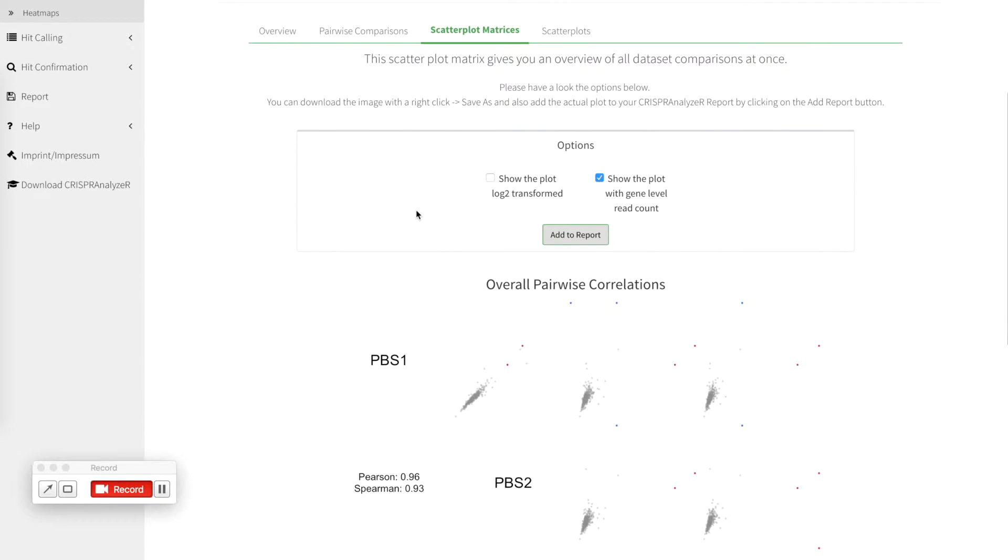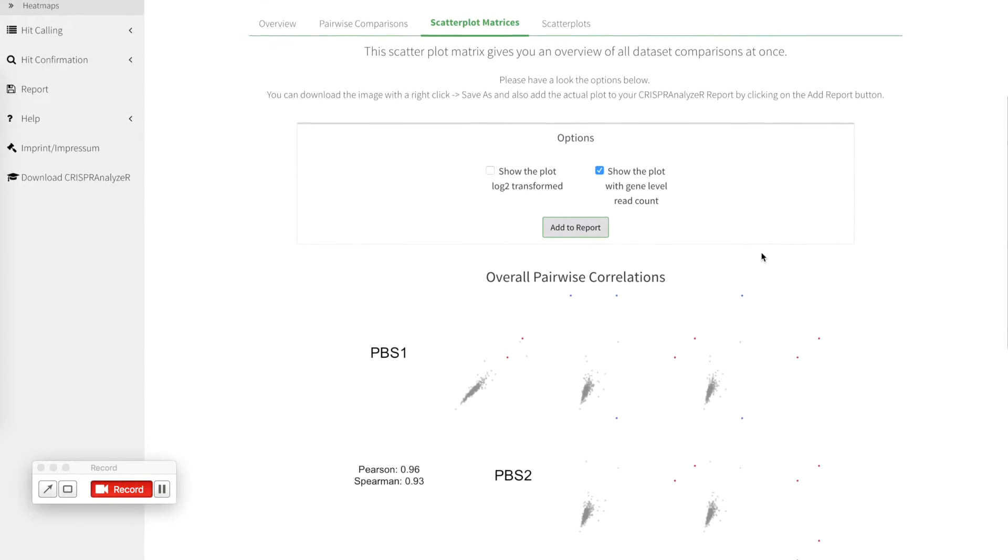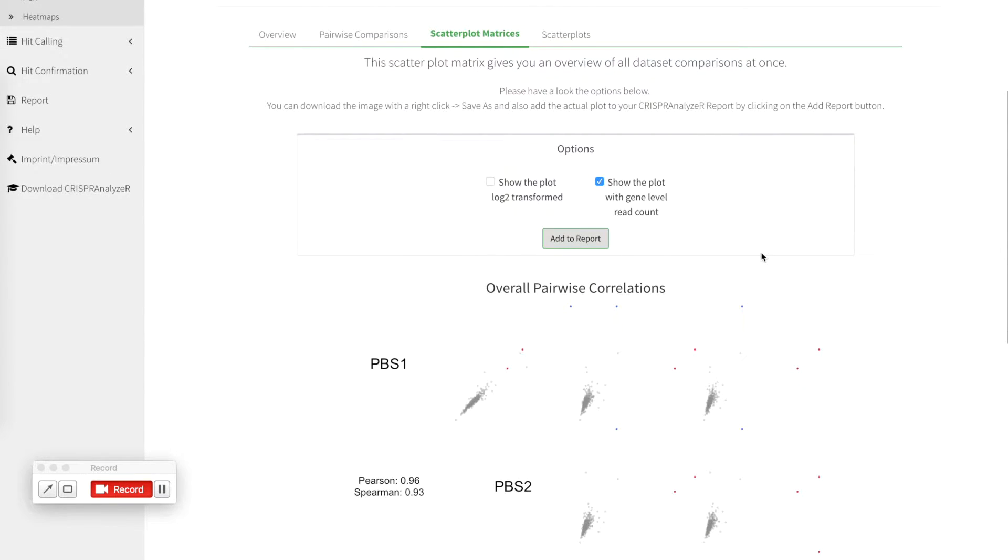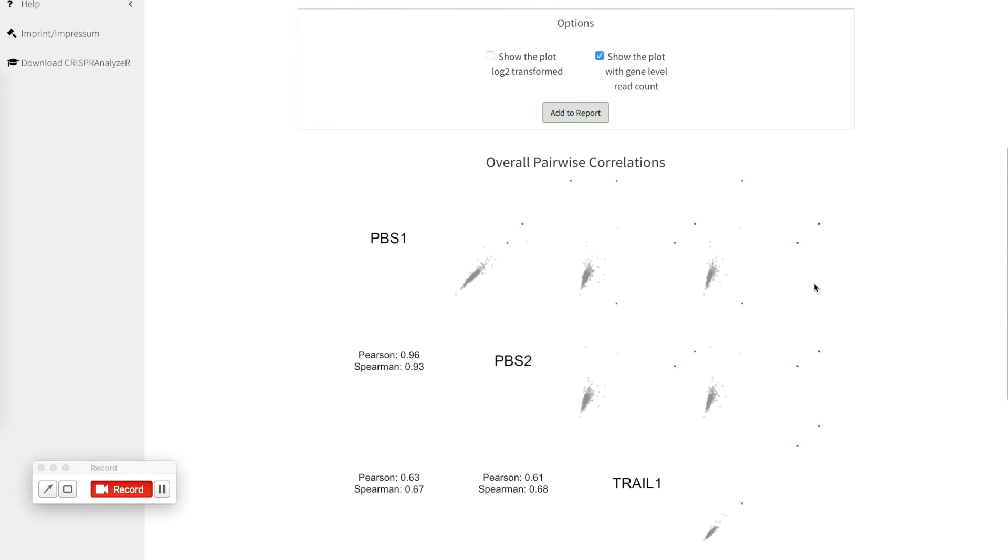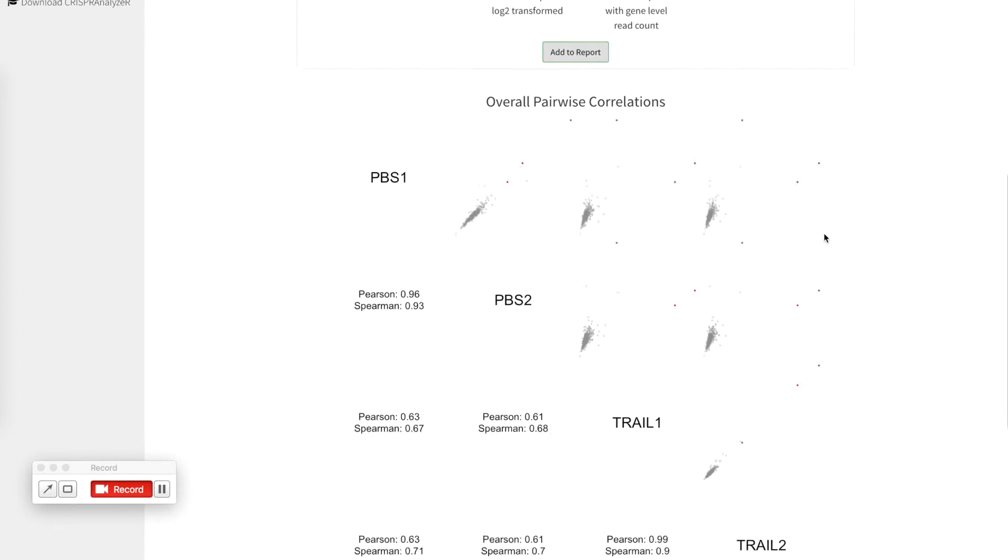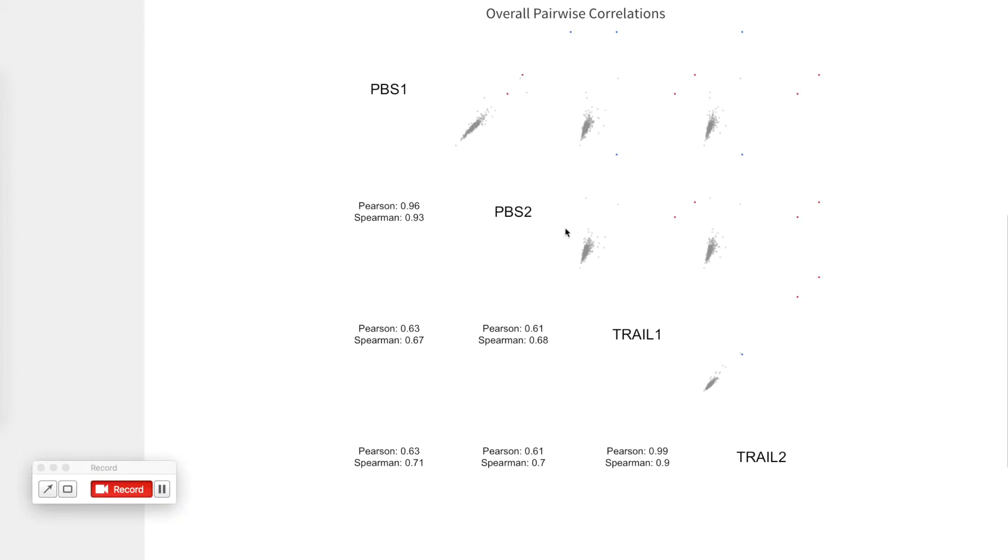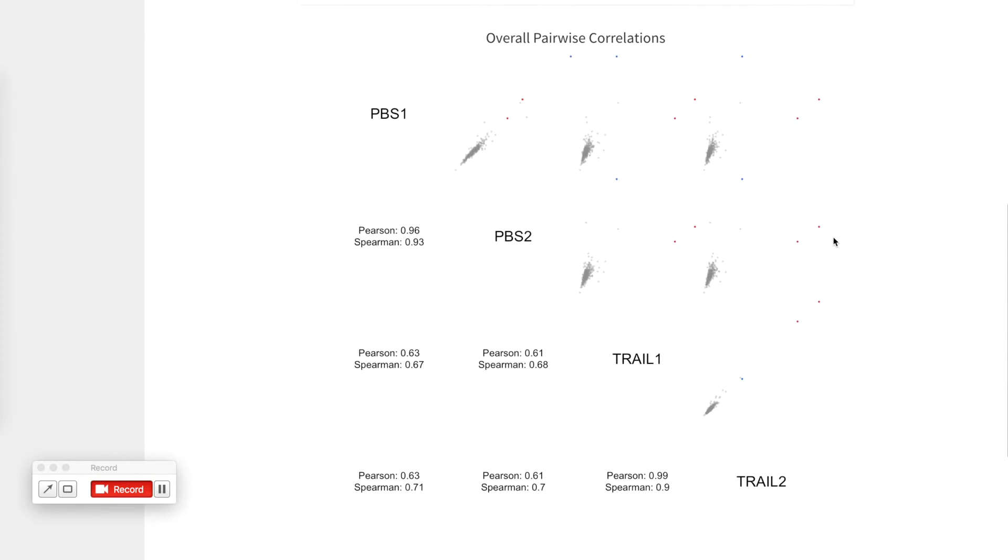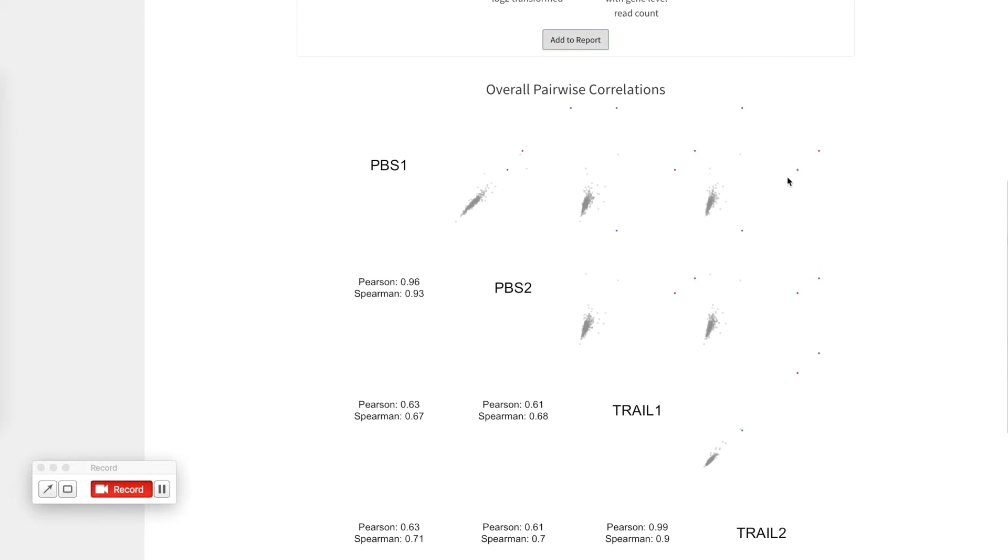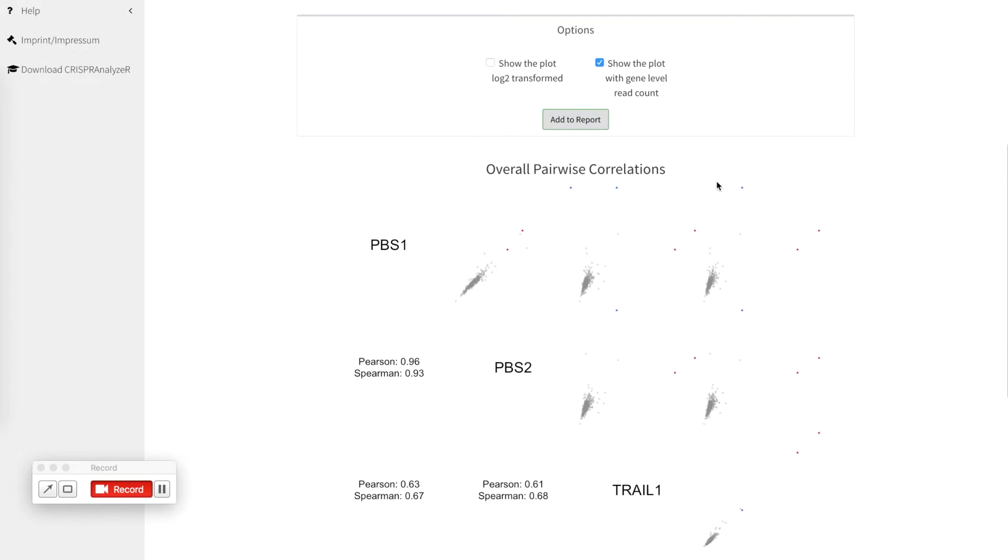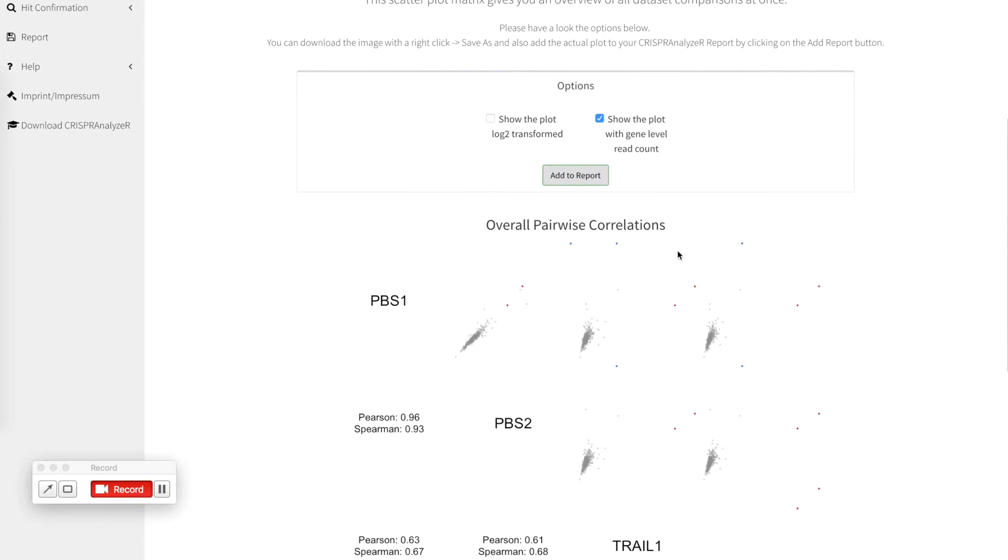If you want to go on you can also get a scatterplot matrix that gives you an overview of how your data is compared. So this is the overall pairwise correlation which means these are our two PBS1 replicates, these are the two trail replicates. You can see the individual correlation between those samples which is pretty high. And here you have the gene level read counts shown with in blue the non-targeting control and in red the positive controls.